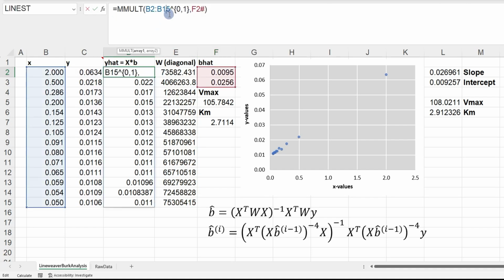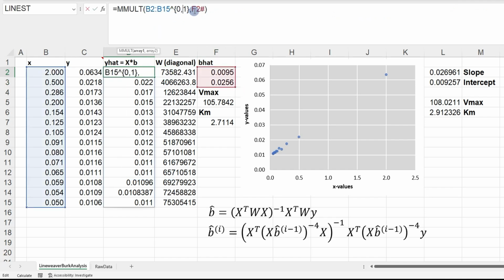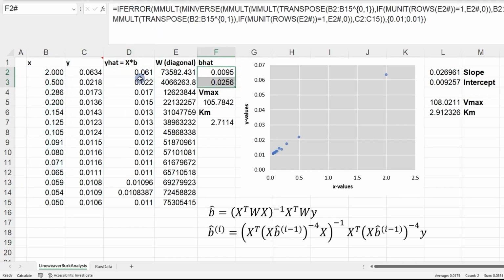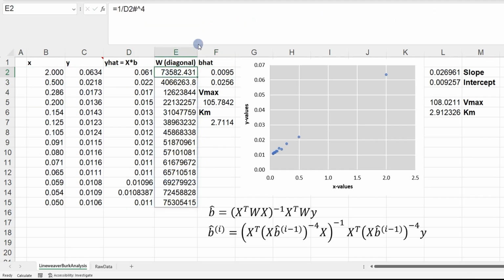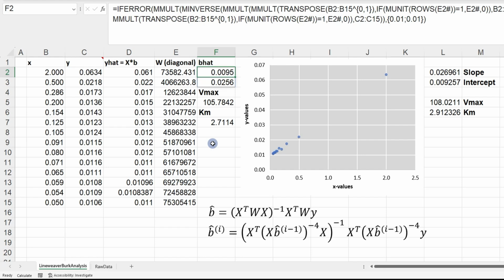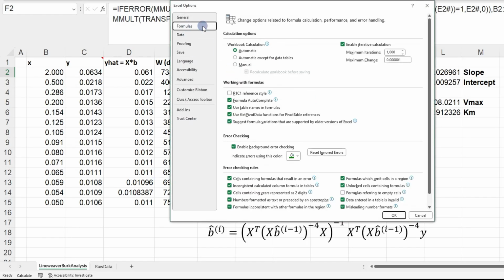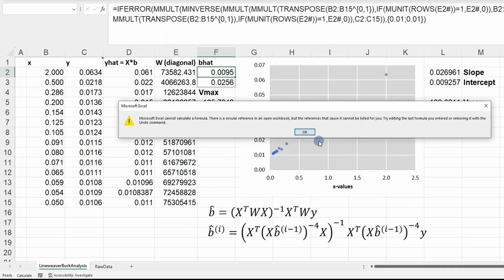This one here depends on those two, right? So you see we have this in that formula. But actually that formula also indirectly applies, because that is related to these values. So there's a circular reference problem that Excel is warning us about. I can induce that when I disable those iterative calculations.